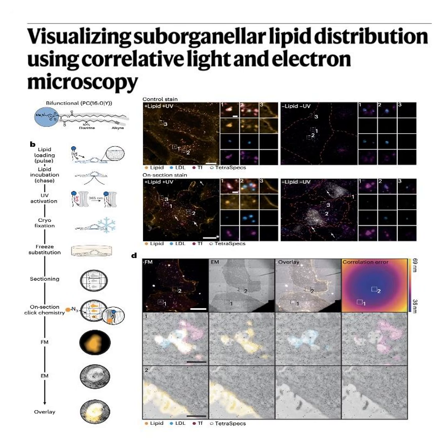tubules, or RTs. And they rigorously validated these routes against known structural proteins, right? Like Rab5, Rab7, and Rab11. They did. So the protein paths are clearly mapped. The ultimate question is, what is the lipid infrastructure doing? Does the floor of the post office sort itself?